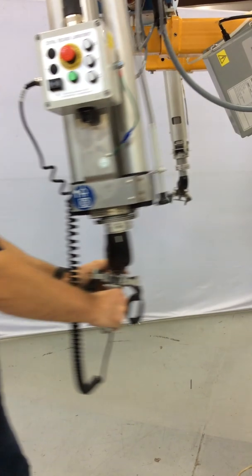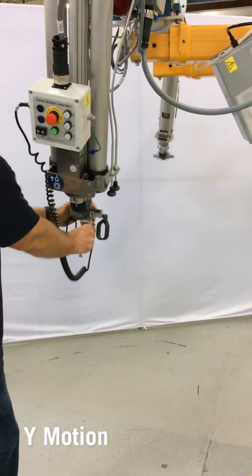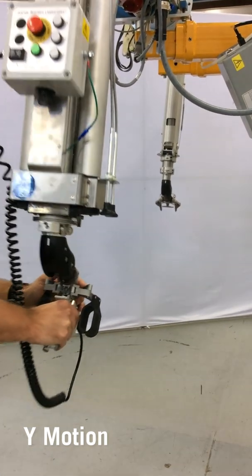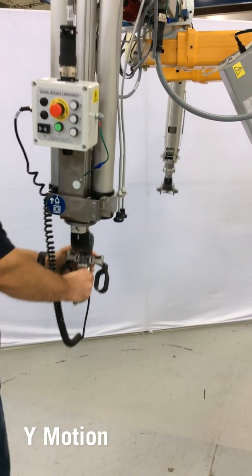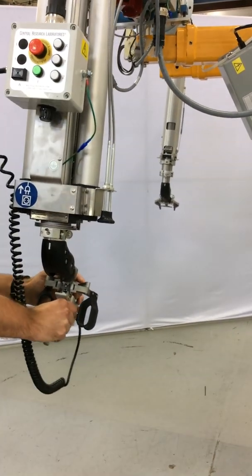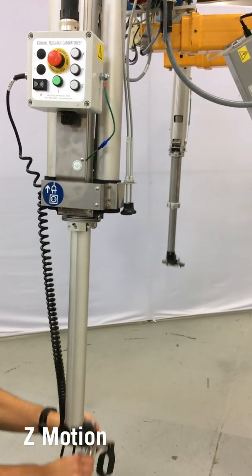Y motion moves the manipulator forward and backward. Z motion moves the manipulator up and down.